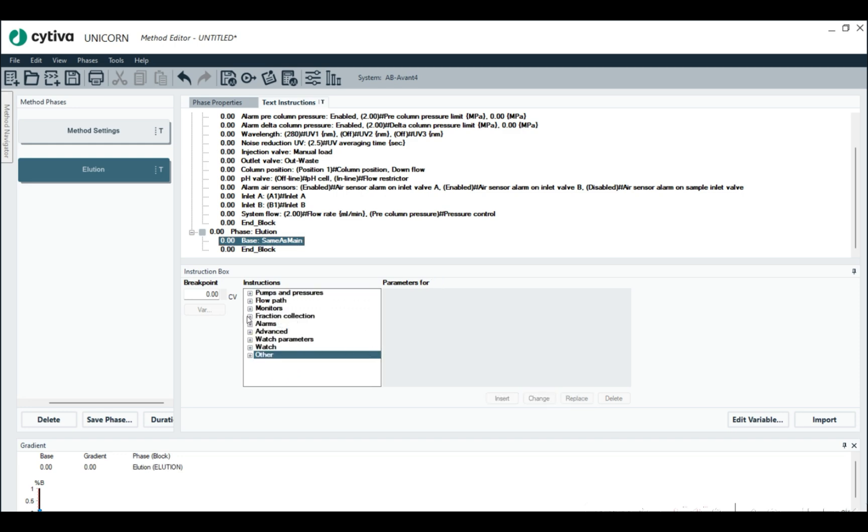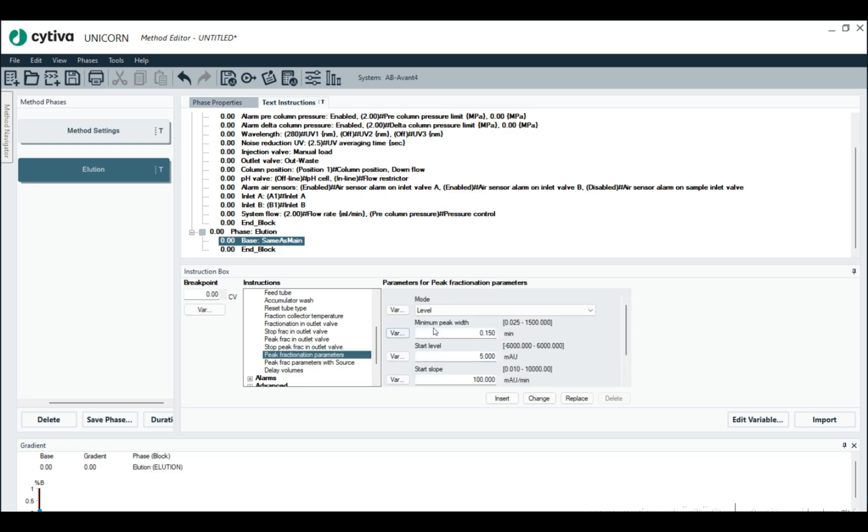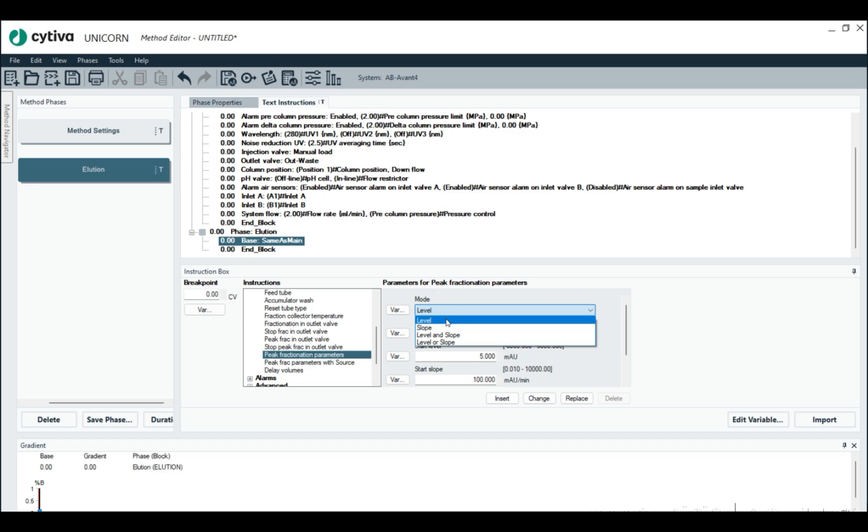But here's how we type in peak fractionation parameters. So we're going to go to fraction collection. And then again, we have to enter the peak fractionation parameters first. So we have our choices of mode. For mode, we have choices of level and slope. And so we're just going to do 50 again.